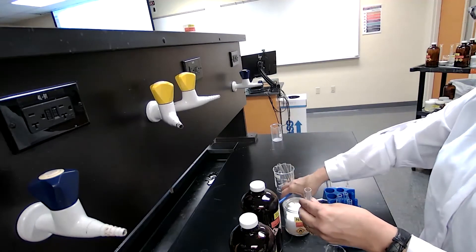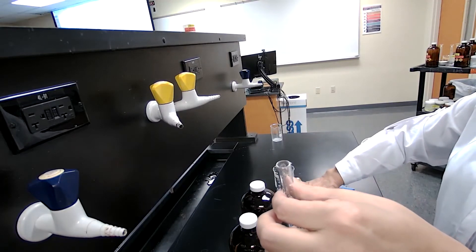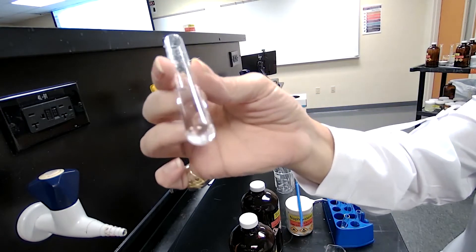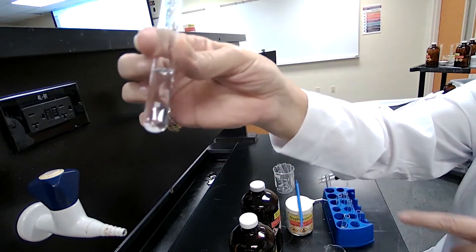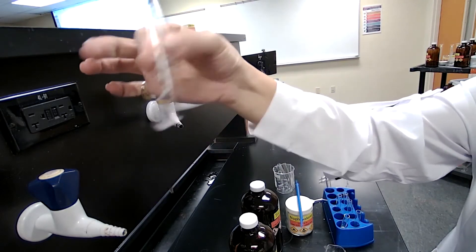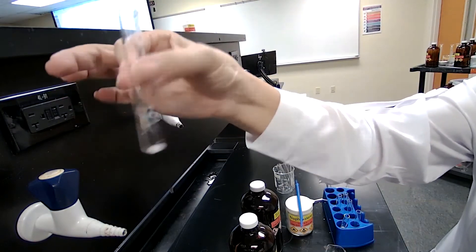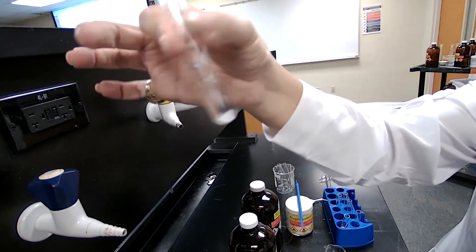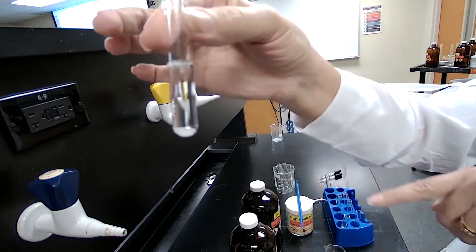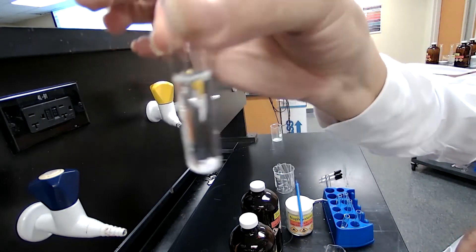Shake it well and examine the solubility. For solubility of a solid in a liquid: if the sample disappears it would be soluble. If the sample does not disappear after mixing and agitating well, the solid is not dissolving — basically forming a two-phase system. Please observe closely and record your observation for your lab report.